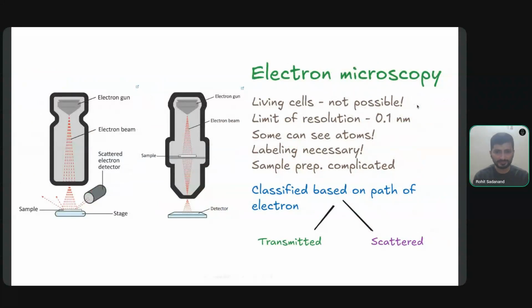And apparently there are some recent advanced microscopes that can allow you to see individual atoms. That is crazy, and probably that is not required for the sake of biological experiments, because you would be interested in all the complex structures that these smaller atoms and molecules make up, and how they are functioning rather than individual atoms, at least for the sake of biology and genetics.